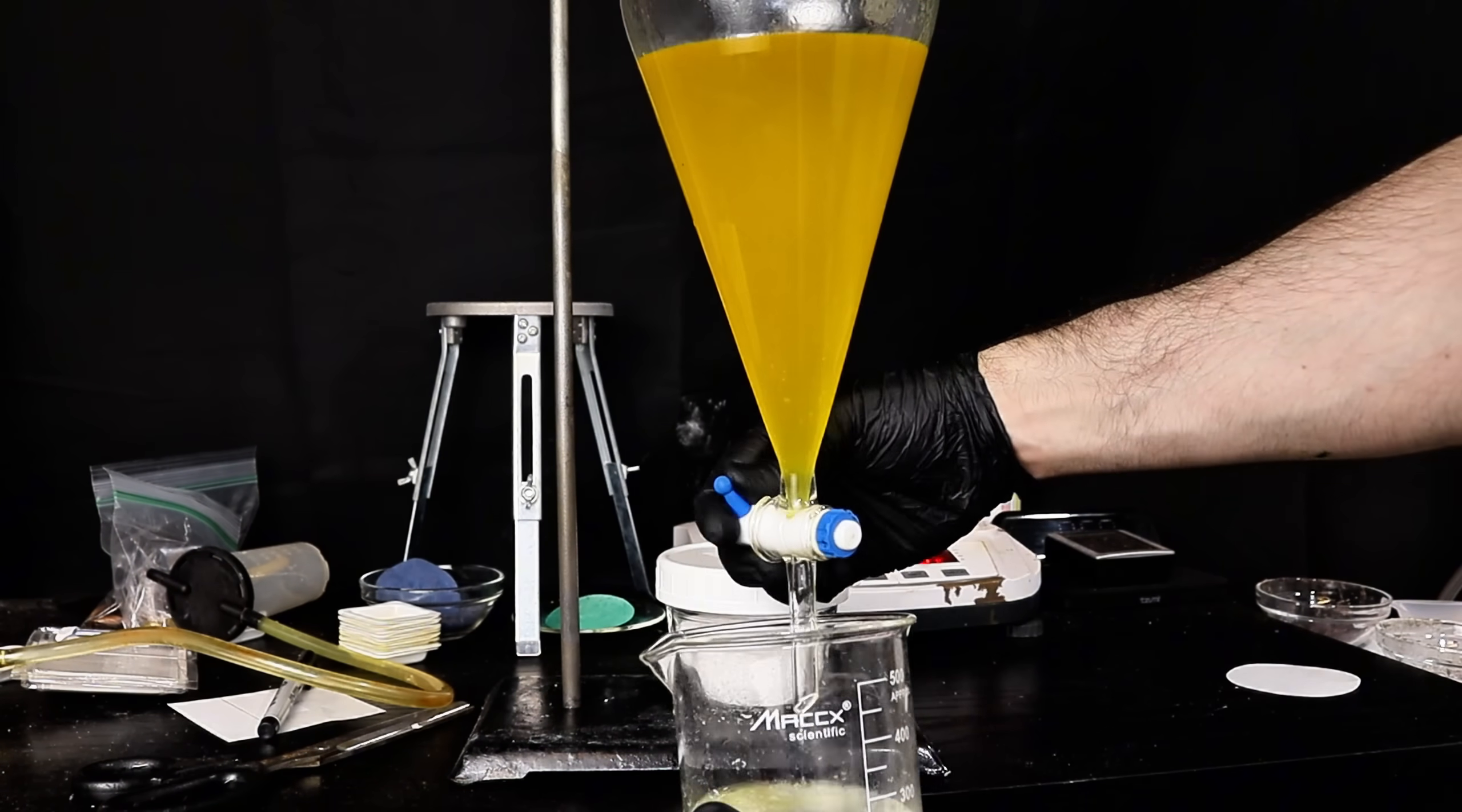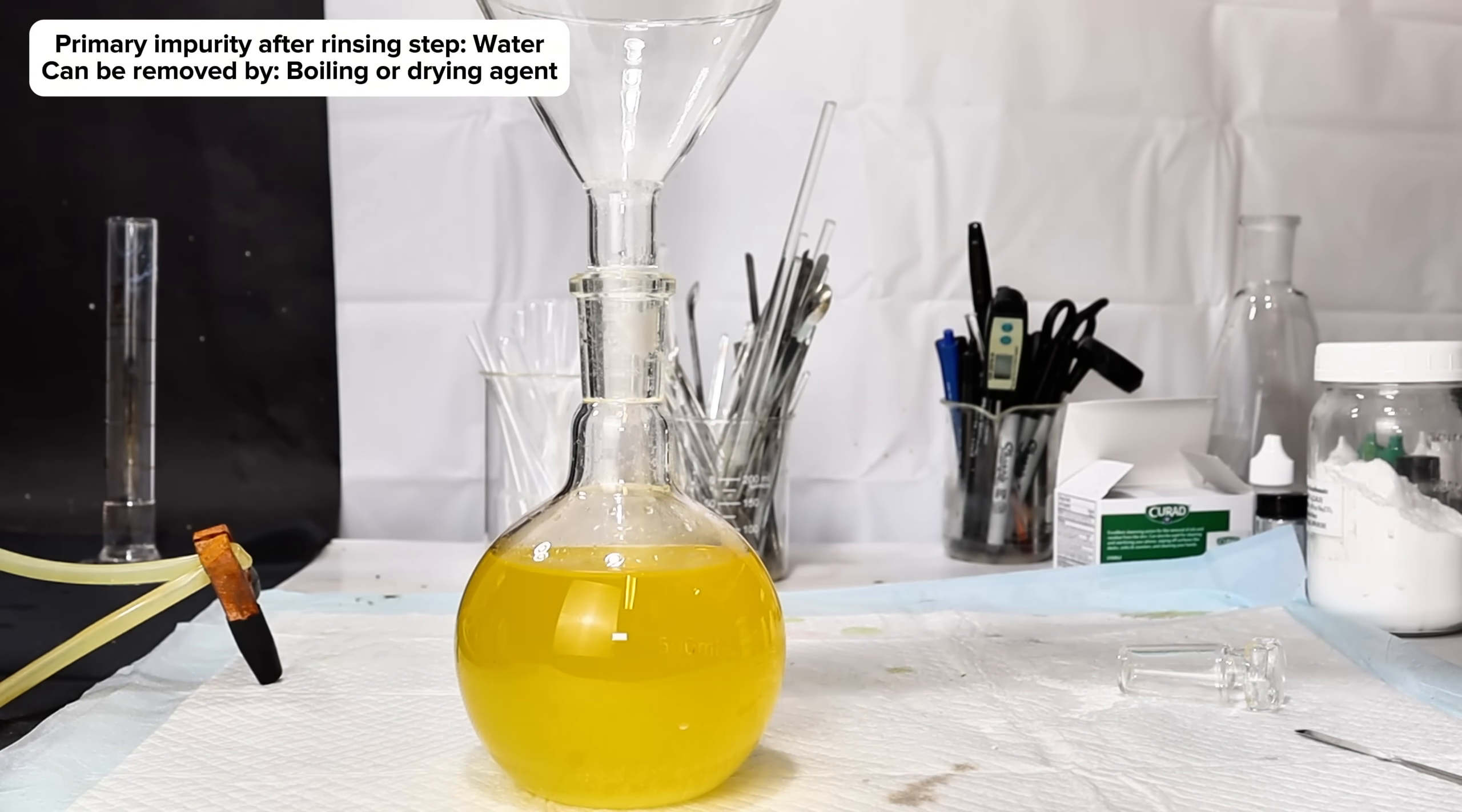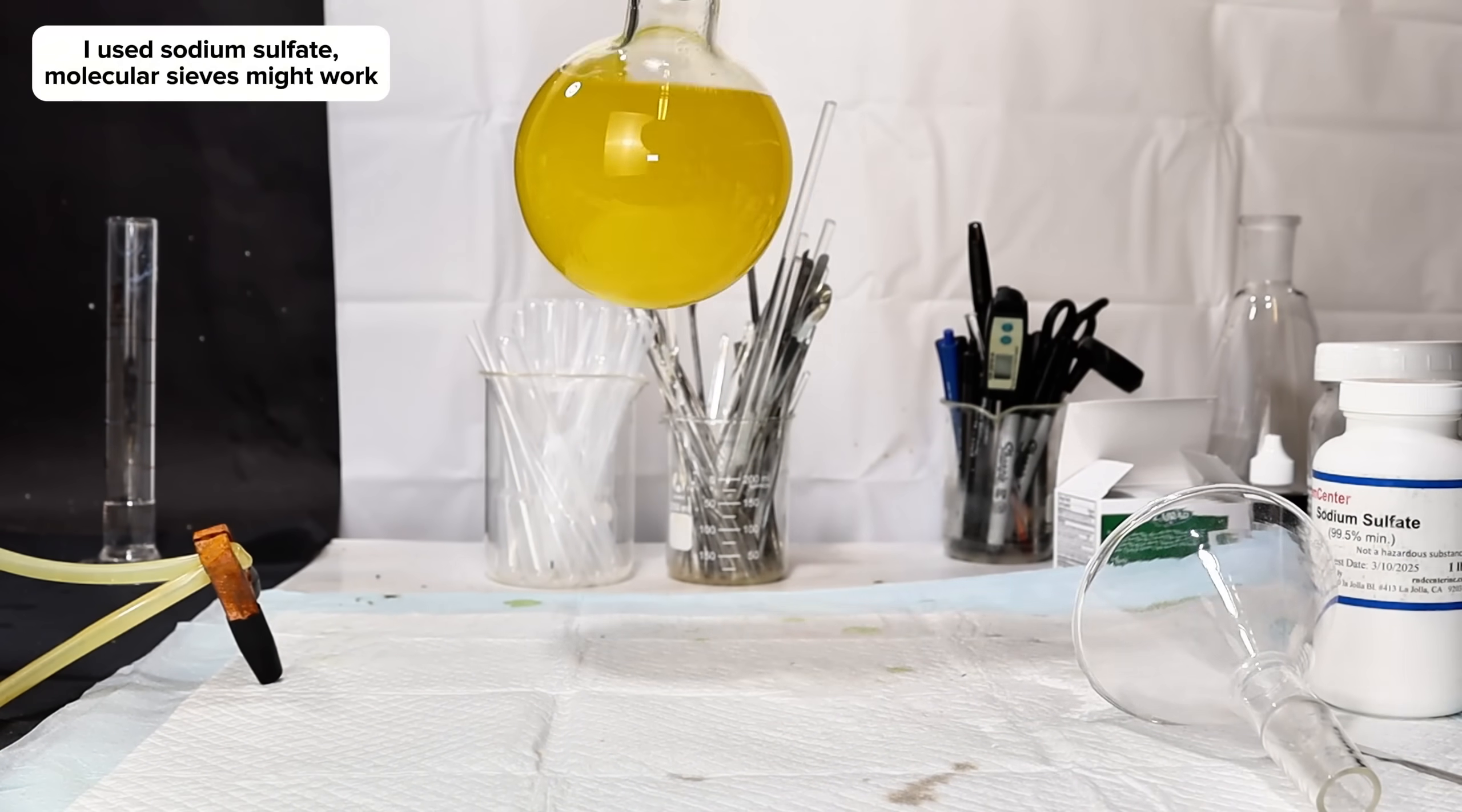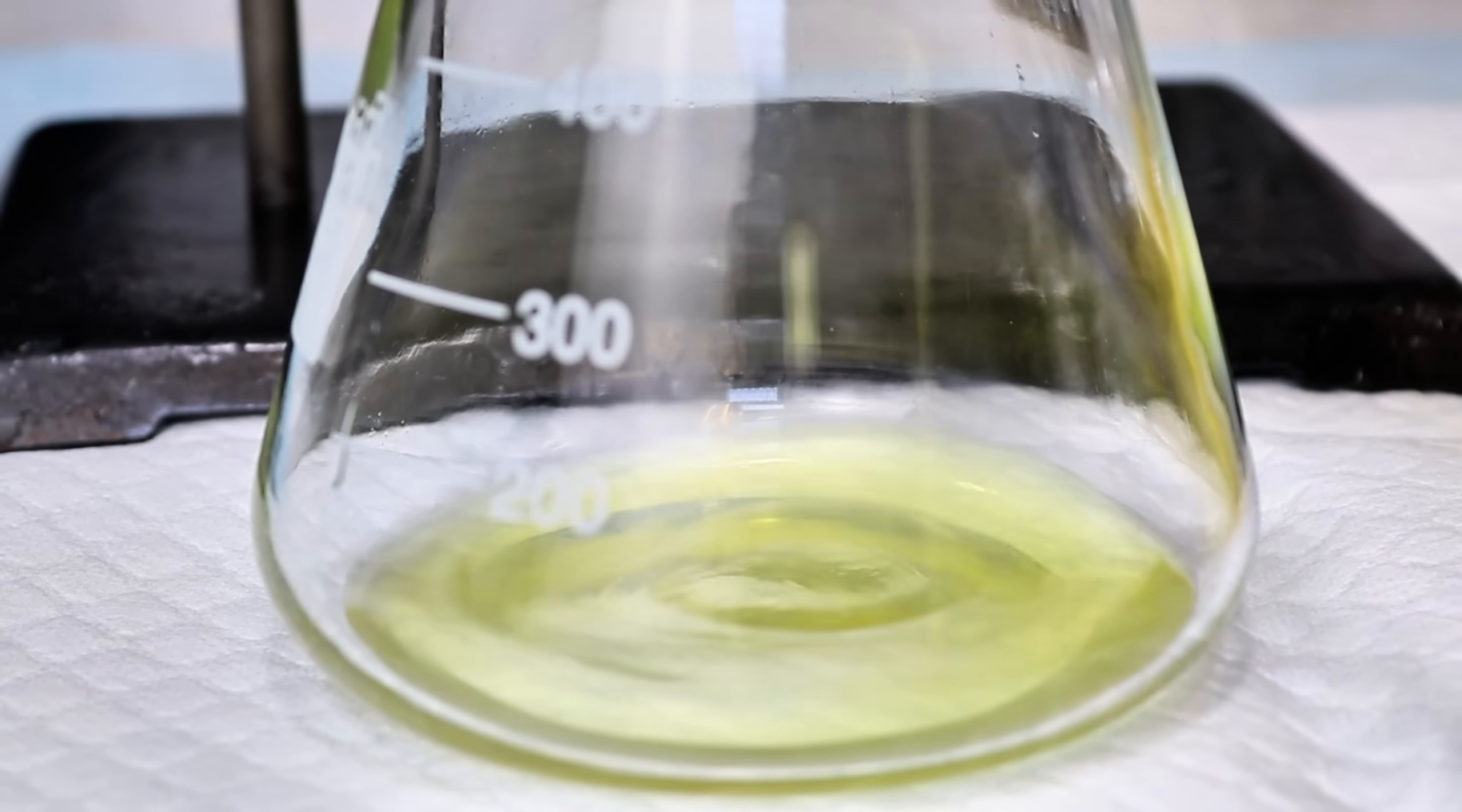The biodiesel is next drained into a flask and at this point the only significant impurity is water. The water can obviously be removed by boiling, but because I felt that was unnecessarily dangerous, I instead dumped in a few grams of anhydrous sodium sulfate and gave the flask a hard shake. This was again left overnight, during which time the sodium sulfate completely absorbed any water that was present in the biodiesel.